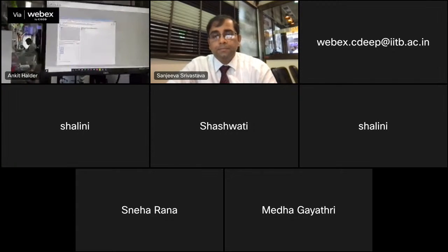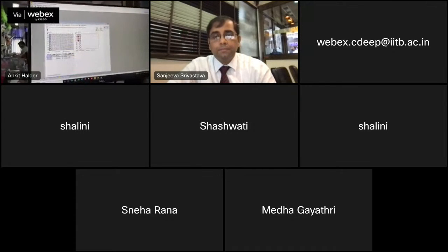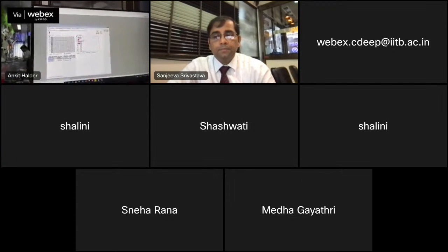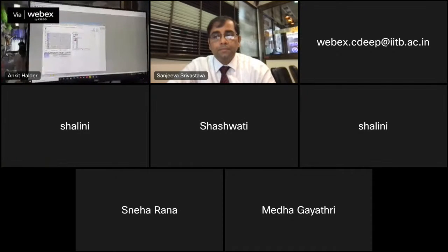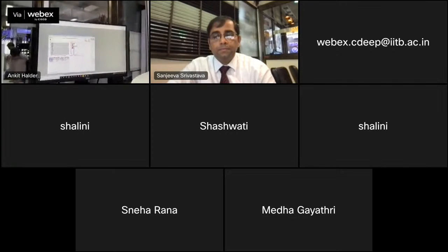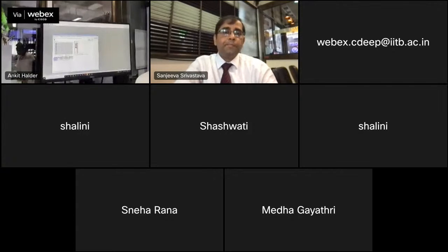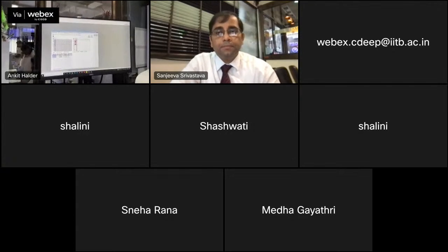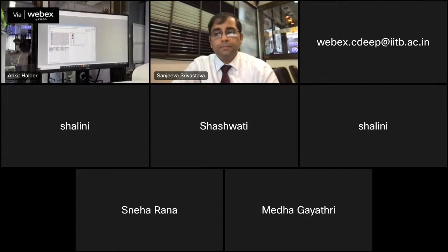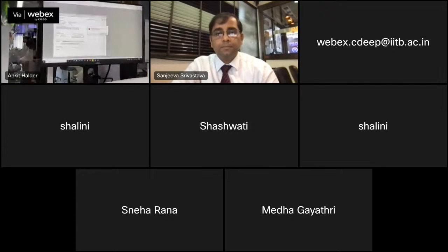Now we'll go to the software part, where I have already set things up for better understanding. Here you can see the part where the sensor plate is shown, and this is the part where the samples are kept. This is the one we are going to load with the antibody. Protein A has the biochemistry to interact with IgGs. Here we have put some IgGs, and here also we have put some IgGs. But these two are blanks, which have the same buffer as we have kept in the hydration buffer as well as in the buffer wells. So let's now see how the experiment looks.